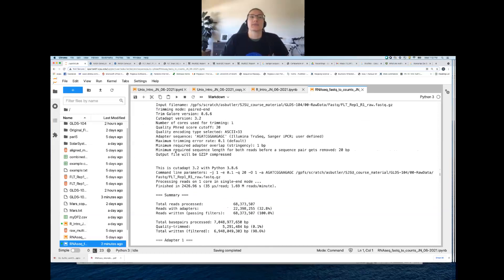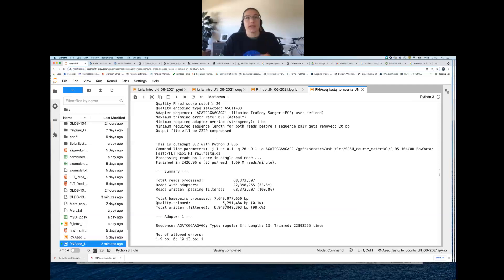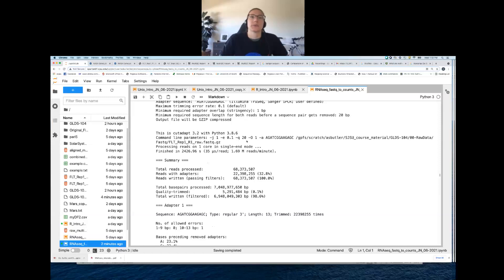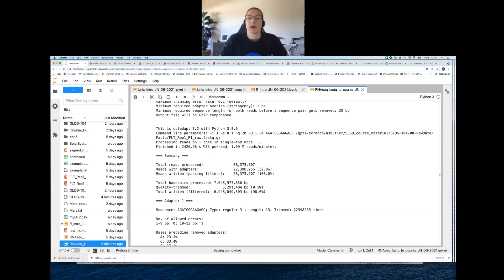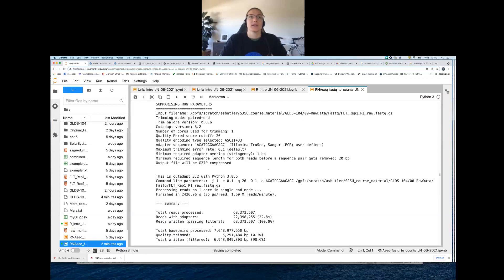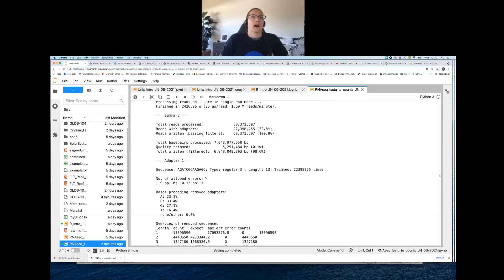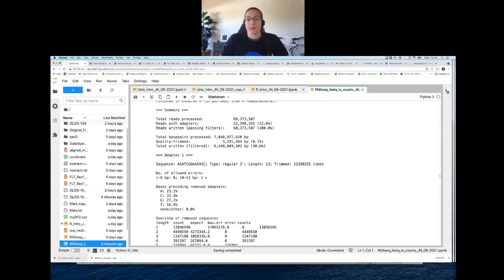By default the output FASTQ file will also be compressed, which is good — we want to minimize the storage space taken up by these large files. Cutadapt is written in Python, so it tells us the version of Python it's running. There are some additional default parameters listed here. Because Trim Galore is a wrapper, these are basically the standard outputs from both Trim Galore and Cutadapt. The most interesting part of the trimming report for troubleshooting is the summary.